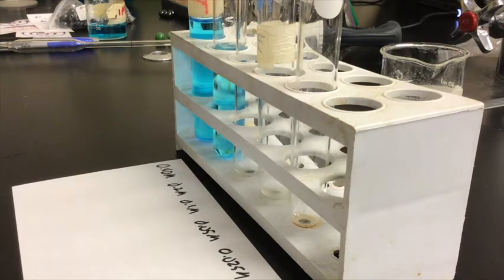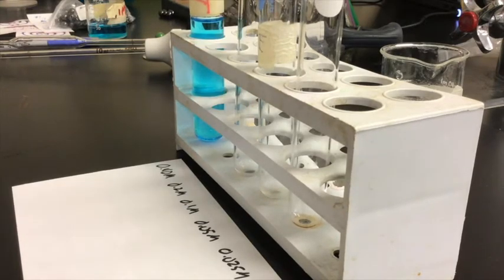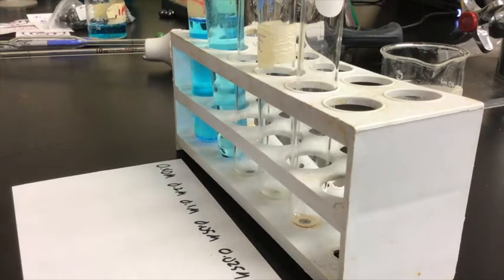Now I have doubled the volume of that from 10 to 20. And so in doubling the volume from 10 to 20, I'm going to be cutting my concentration in half for this. So that is now 0.2 molarity because it is that concentration cut in half. So all I'm going to do now is take this and shake, shake, shake, shake, shake, make sure this is good and mixed. And if I make sure that this is good and mixed, now I've got myself a 0.2 molarity solution.